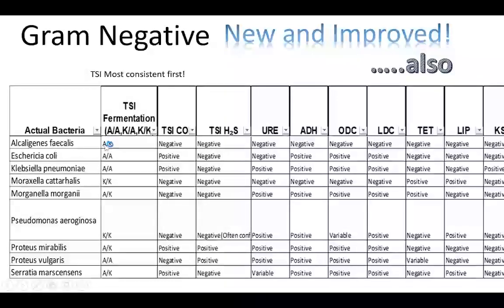But that one does a little bit of weirdness. It sometimes alters the media a little bit, because when it's growing on there, it'll start dying and produce acid. So if it doesn't look like a strong yellow, you just go, that's just messed up. I'll show you another way to differentiate that one. Those are the 3 oxidative organisms, so they're really easy to identify on the TSI. You're just like, oh, the whole thing's red. This has to be one of these 3 organisms. Easy test.